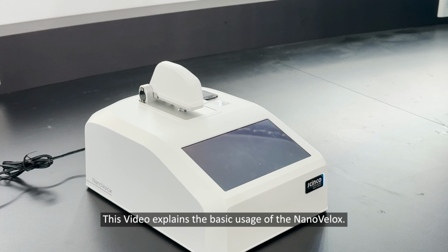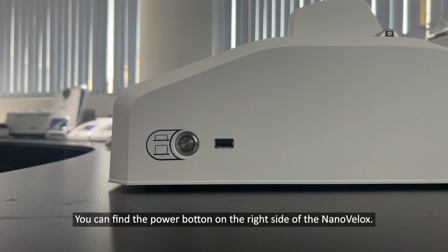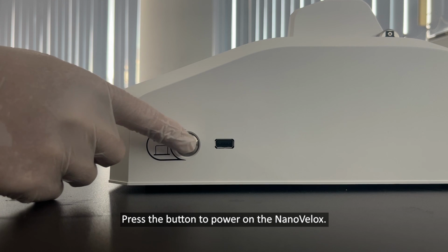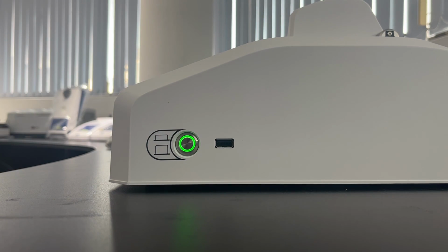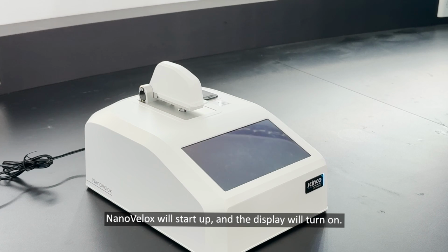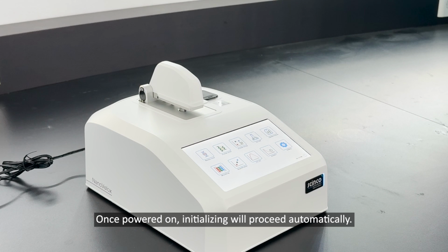This video explains the basic usage of the NanoVelox. You can find the power button on the right side of the NanoVelox. Press the button to power on the NanoVelox. NanoVelox will start up and the display will turn on. Once powered on, initializing will proceed automatically.